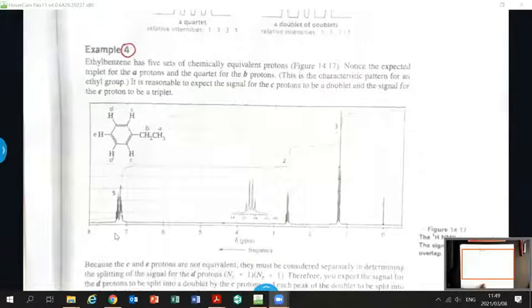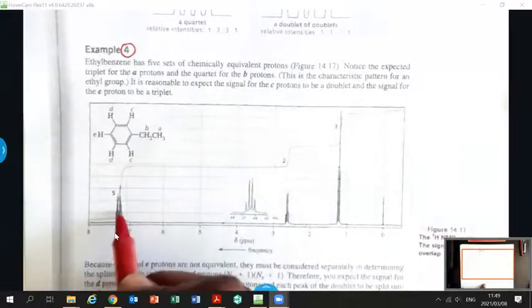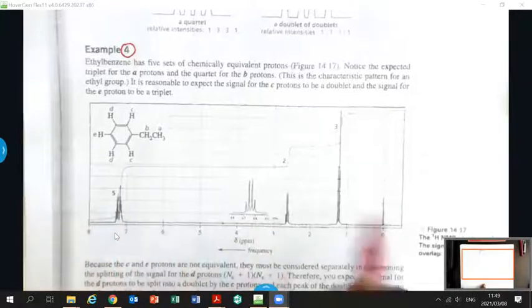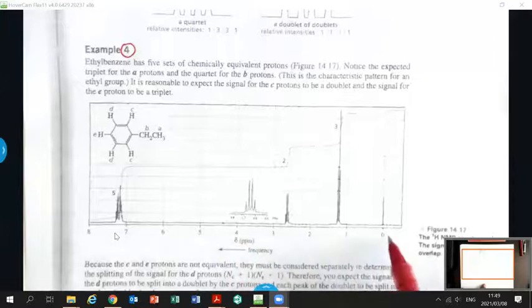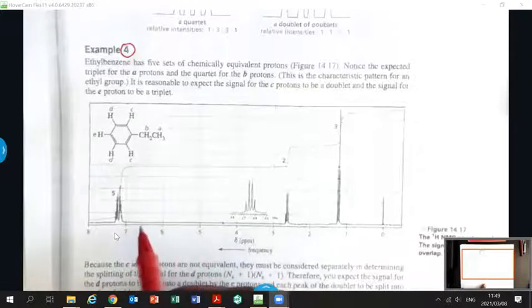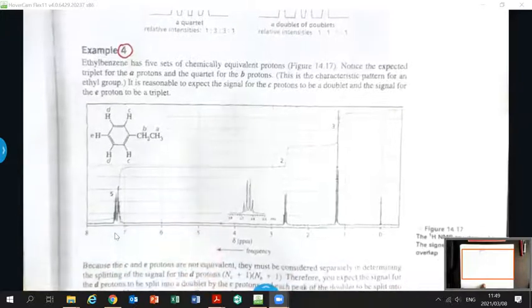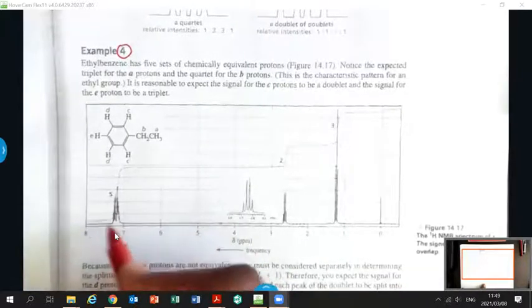All right, so if I look at this particular spectrum, I have 3 resonances here, but I actually have more than 3 resonances because there's some overlapping resonances in this region, right? And if I look at this spectrum, we've been dealing between 0 and 4, generally, up until now. But as I told you, between 5 and 6, you get double bond protons, and between 6.5 to about 8, you get aromatic ring protons. So this is the first example that you're seeing now where you have aromatic ring protons.